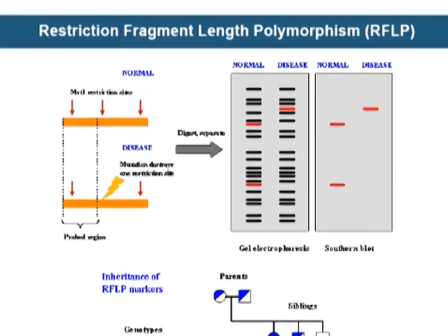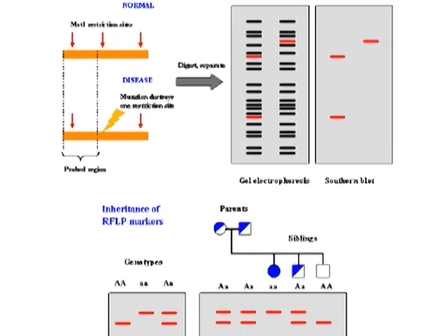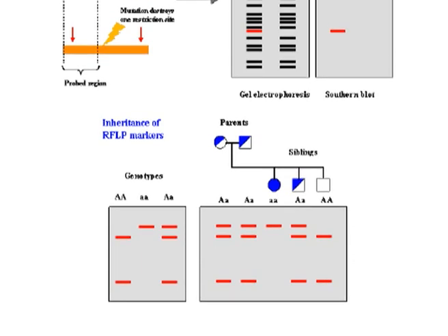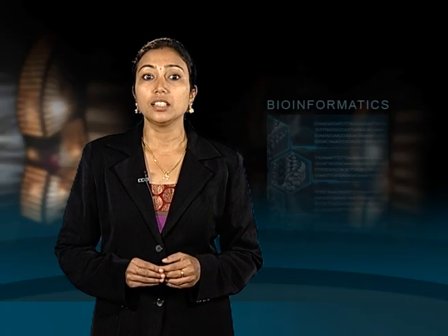First, DNA is extracted from blood, saliva or other samples and the purified DNA is digested using restriction endonucleases. The recognition sites of these enzymes are generally 4 to 6 base pairs in length. The shorter the sequence recognized, the greater the number of fragments generated from digestion.